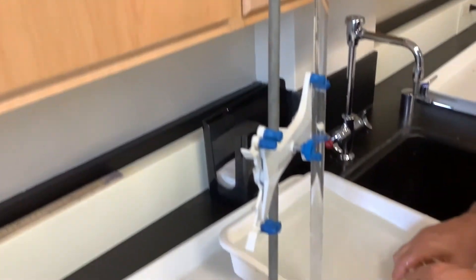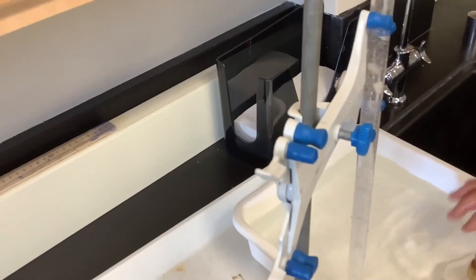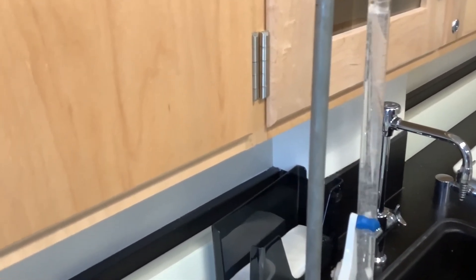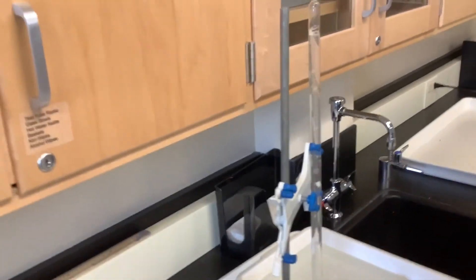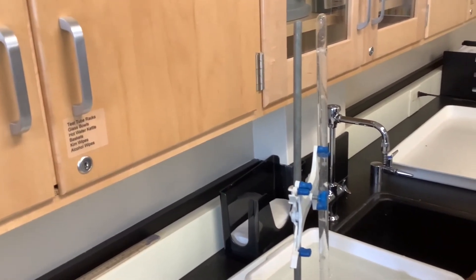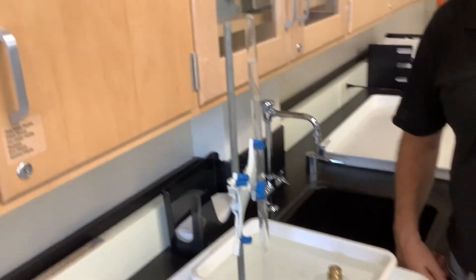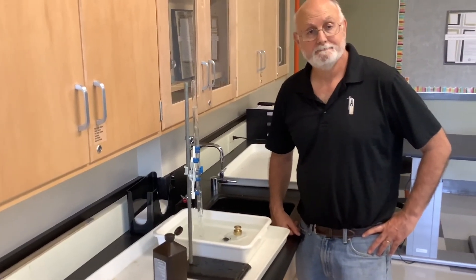Now we get these bubbles, which start being generated and going up. One thing to notice about the bubbles is that they're pretty equidistant from each other. Think about that — if the bubbles are basically the same volume and equidistant from each other, think about what's happening with the rate. So this is what we're doing: we're going to collect the gas. The more reaction you have, the more gas you produce, and we're going to try different conditions to see how it affects enzyme activity.